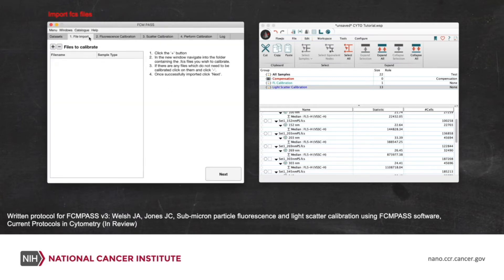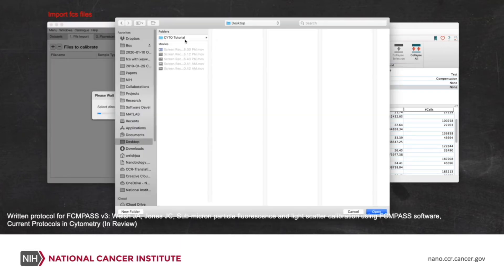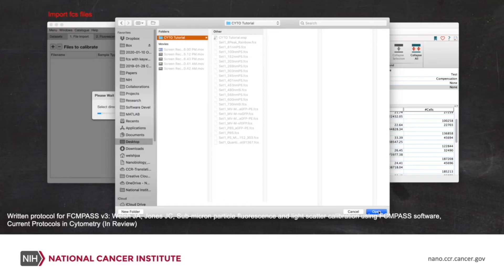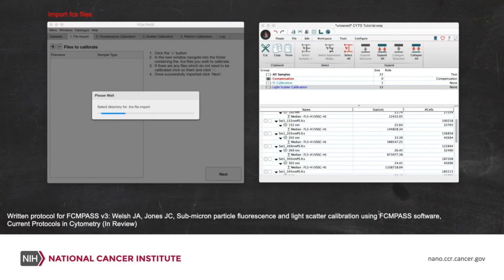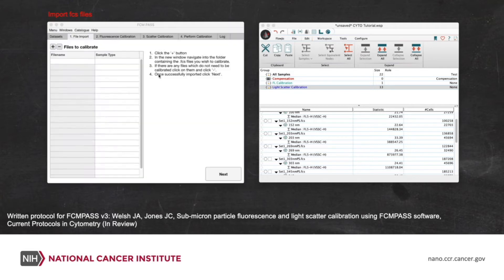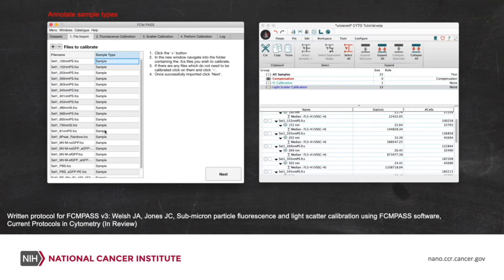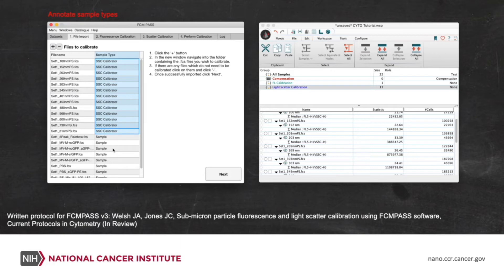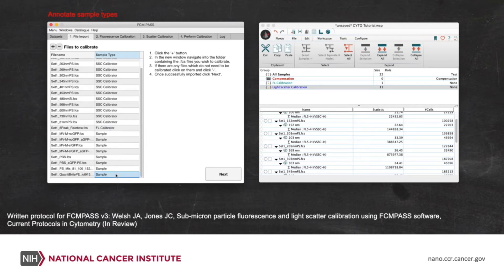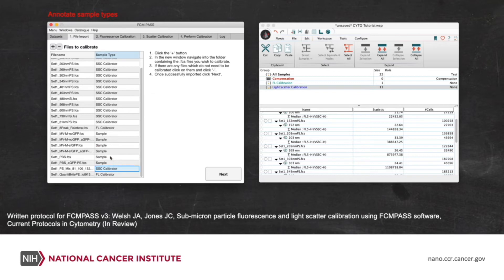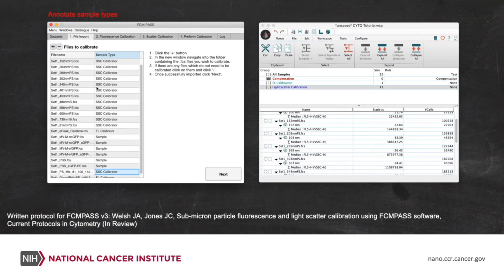We just need to import our FCS files now. So we click the plus icon, navigate to where our files are and click open. This will now import all of our FCS files and it will also extract some of the parameters like the threshold for each of the channels, as well as what the parameter names are. We're going to define these sample types first that will help with our annotation. We'll turn all of these NIST traceable beads into side scatter calibrators and our fluorescent beads, our eight peaks and our PE Quantabrites will turn into fluorescent calibrators and the rest will just leave as standard samples.